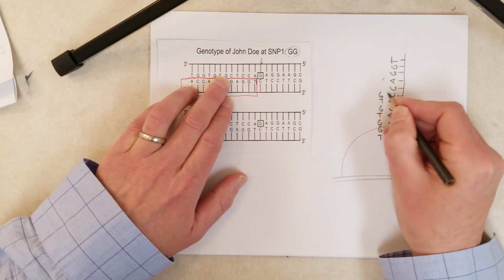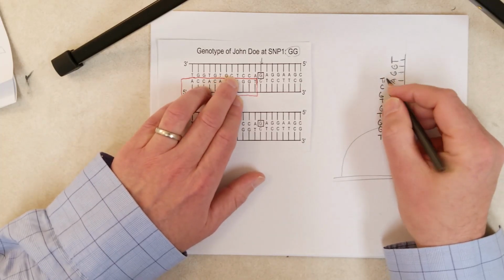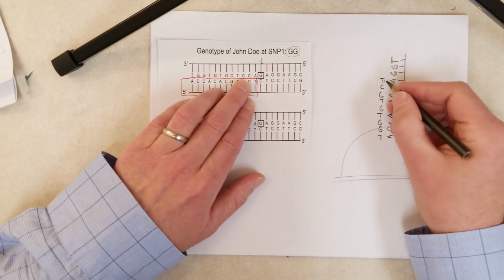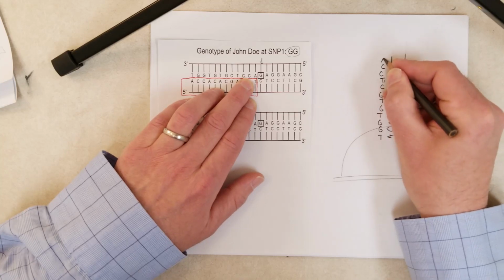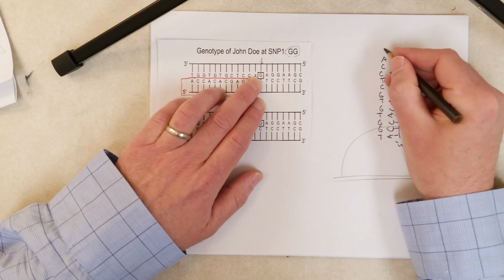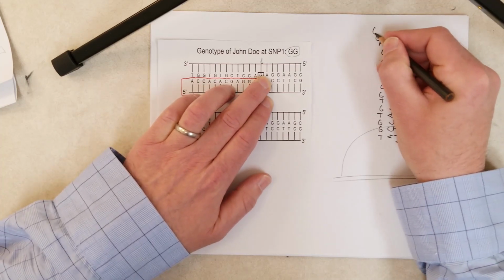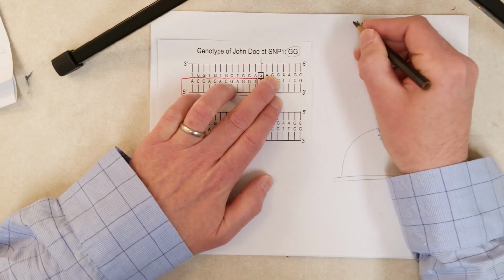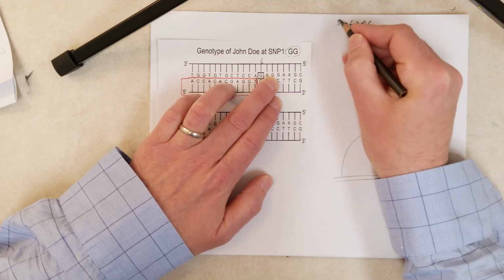And keep in mind, every part of John's genome is, let's say there are 1,000 copies of it. So there are 1,000 of these sequences, this strand right here, floating around in the solution above the bead. And eventually they will find it. And so we're not going to end at the A here, right? We're going to keep going. The products were sheared randomly, so who knows where the DNA will end. But at some point it was sheared and we just have a 5' end there.